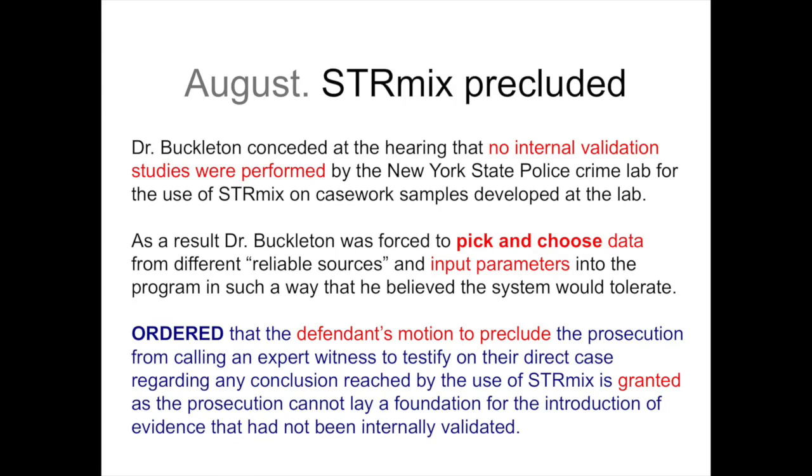How much dropout? So all of this was subject to subjective decision-making, where a small difference in parameter or data had a huge impact in inclusion or exclusion in the end. And so the court ordered that the defendant's motion to preclude be granted because clearly with such a high sensitivity to parameters and data, without an internal validation or calibration or any of the things that are needed for the software, it would be hard to say that it was completely reliable.